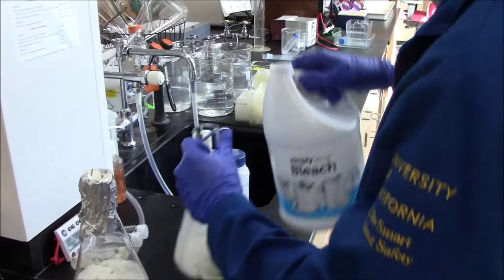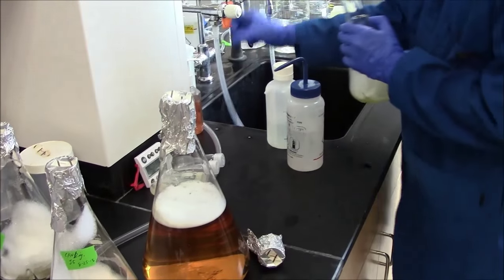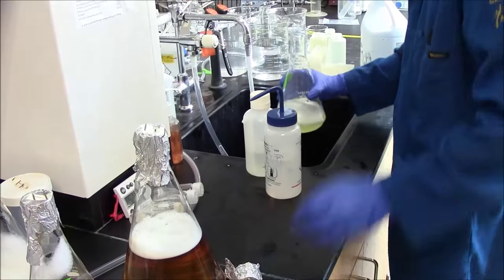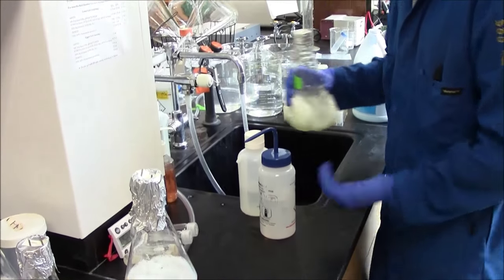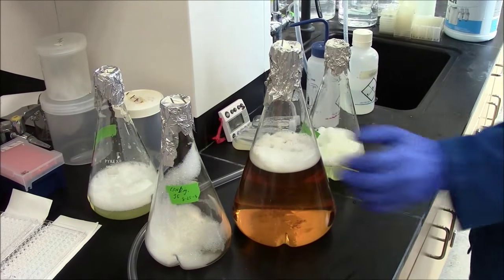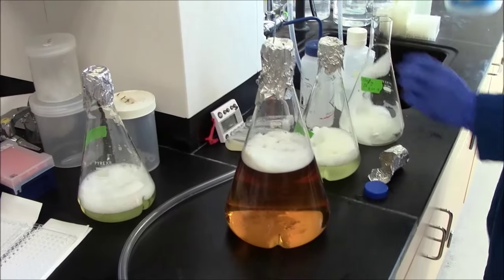A little bit of bleach in. Here Josh is disinfecting the original flask that held the bacterial cultures. It should be 10% bleach, so one part bleach, nine parts water. You swirl it around and that will kill the bacteria. Leave the bleach in the flask at least 30 minutes to disinfect them. In this case, we can reuse the 10% bleach solution to disinfect other equipment.